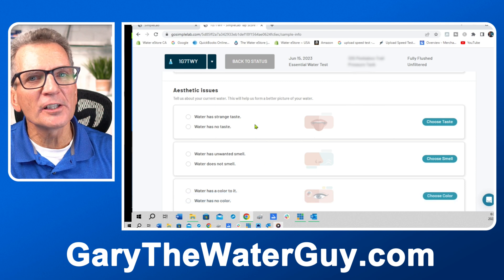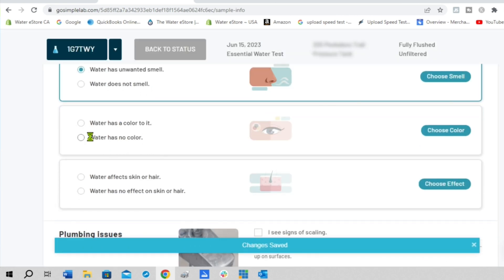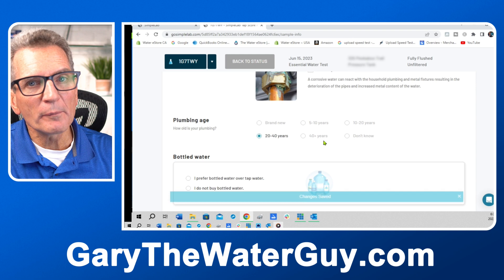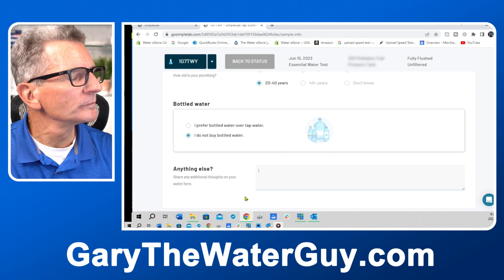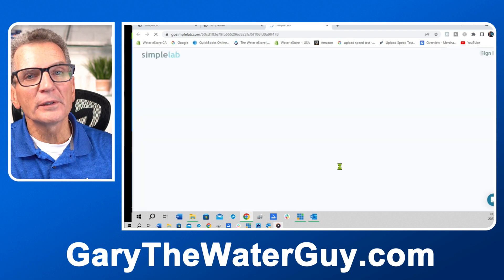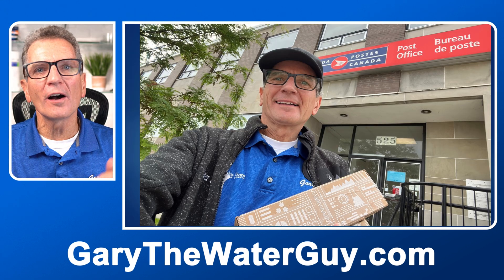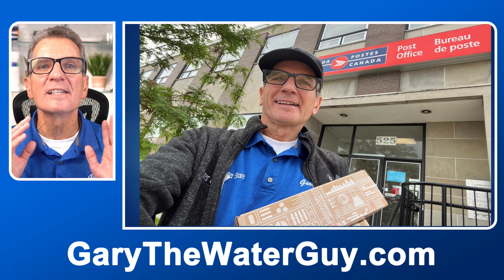You'll also need to note some aesthetic concerns — basically what concerns you and your family about your water. My sample didn't have any color, but the tannin sample did. Age of the plumbing may have some bearing on the testing. Without water filtration, we do get some rusty stains. Do the same thing for the tannins test, entering the same information. Then take the postage label out of the box, seal the box, apply the label to the outside, and take it to your nearest post office to mail it to the lab.